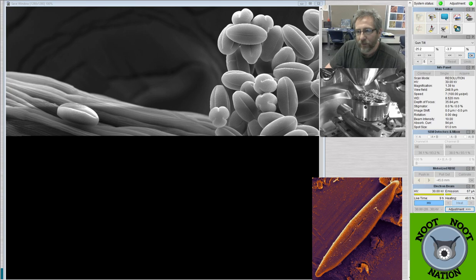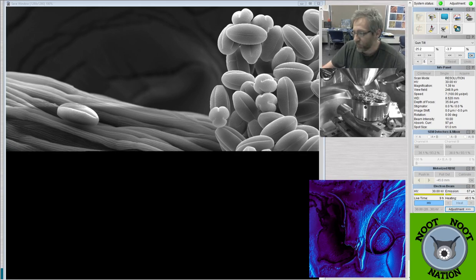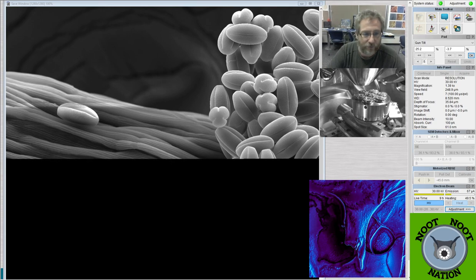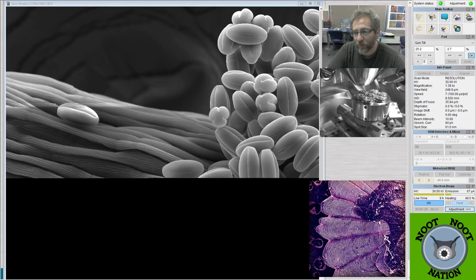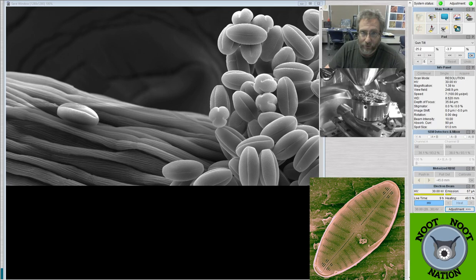So, yeah. And I have, in the past, Eric, I've put on some diatoms that were millions of years old. I have some materials over here that are 10 million year old diatoms. I've described species and erected genera, including ones from species that are, you know, 9-10 million years old. Primarily look at diatoms as my primary research tool.